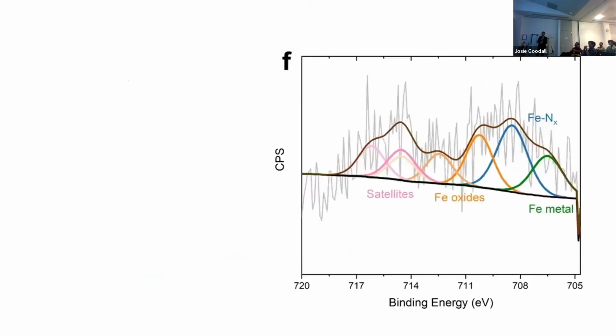Okay, fitting noise. I should say all of these figures are in published papers. Some of them in journals you would have heard of as well. So here they have some noise, but they decided it must be iron. So they fitted iron. Not much to say here. Don't do it.